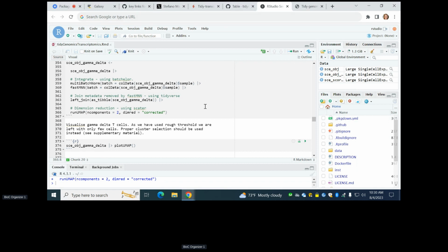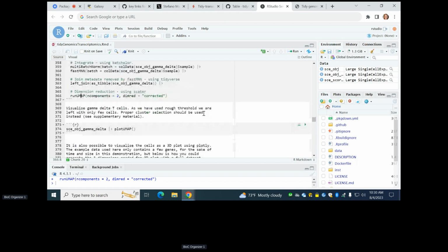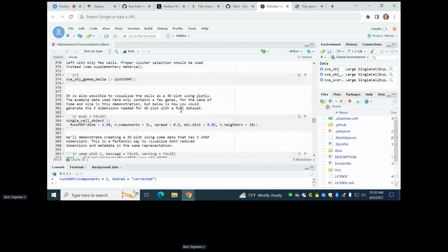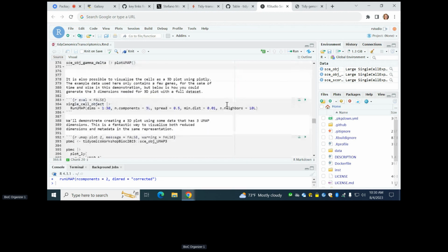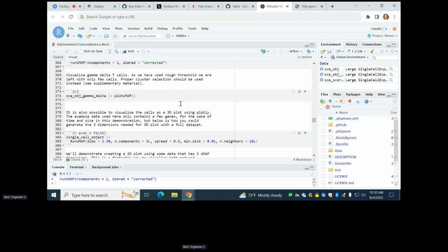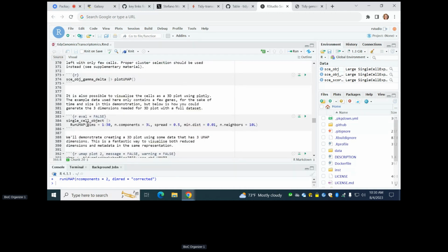Let's discuss. I'm interested because we are evolving this day by day. Basically, that's it. This was a bit of a showcase. A cool thing: we interface with Plotly as well because every column is a variable. You can easily apply Plotly, so interactive plots, plotting the reduced dimension with the colors based on cell types or whatnot. And here I'm just showcasing that.